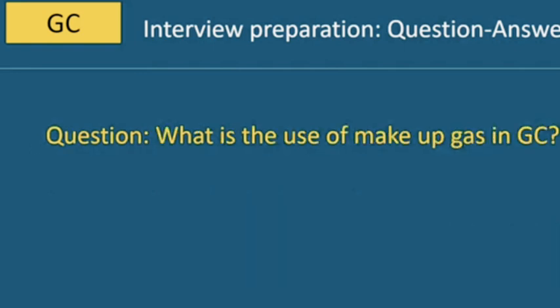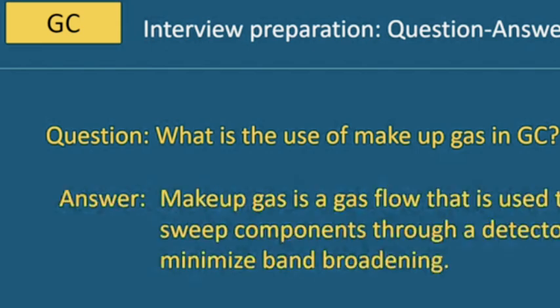Next question. What is the use of makeup gas in gas chromatography? Makeup gas is a gas flow that is used to sweep components through a detector to minimize band broadening.